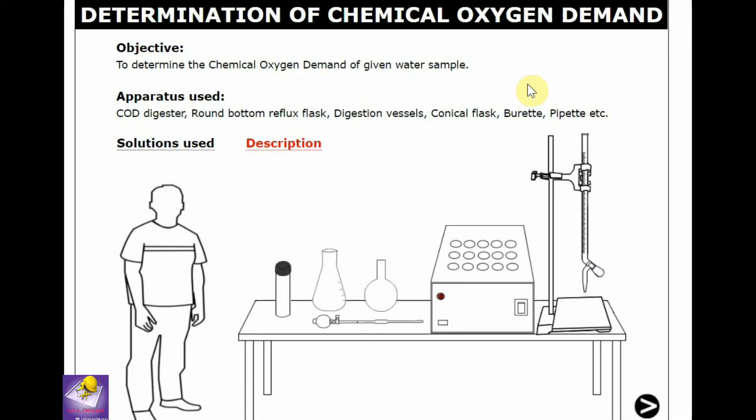Hello guys, today we discuss the determination of chemical oxygen demand in a water frame. The apparatus we require: digestion vessel, conical flask, round bottom reflux flask, graduated pipette, COD digester, and burette.